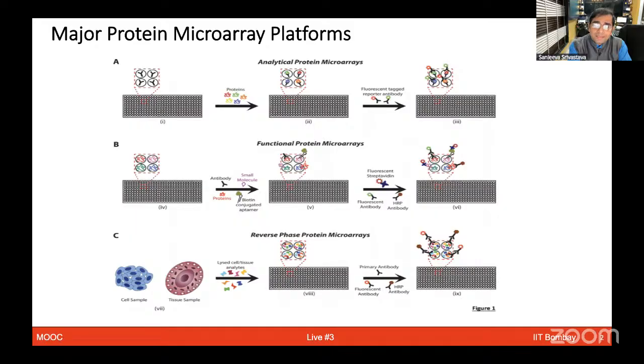But the idea is, can we have that many purified proteins? If you don't have that many purified proteins, then alternative approaches have also been utilized. For example, you have studied NAPPA, nucleic acid programmable protein array. And likewise, there are many other cell-free expression platforms which we have been talking about, right? Like PISA and MIST, multiple spotting technology, protein in situ arrays.